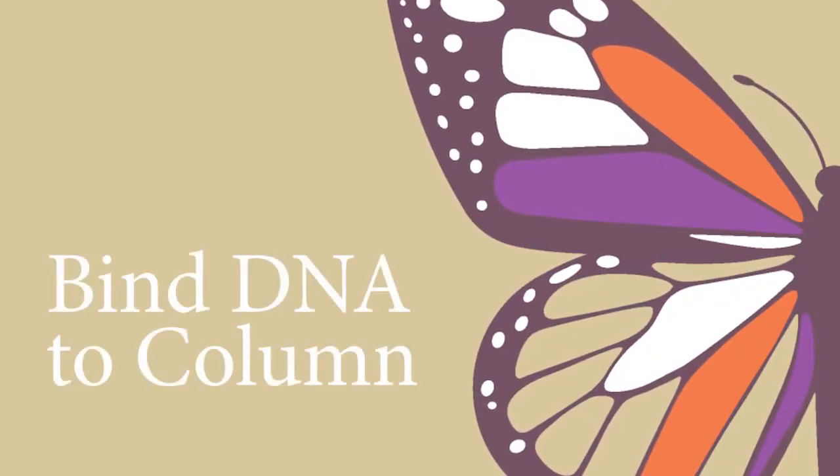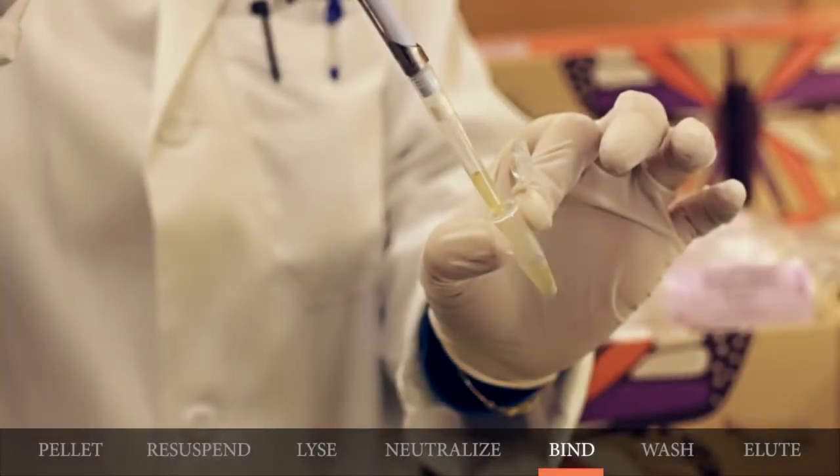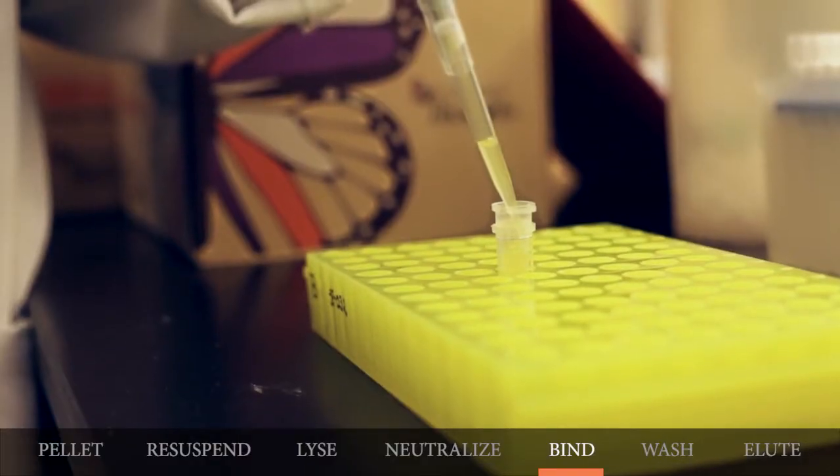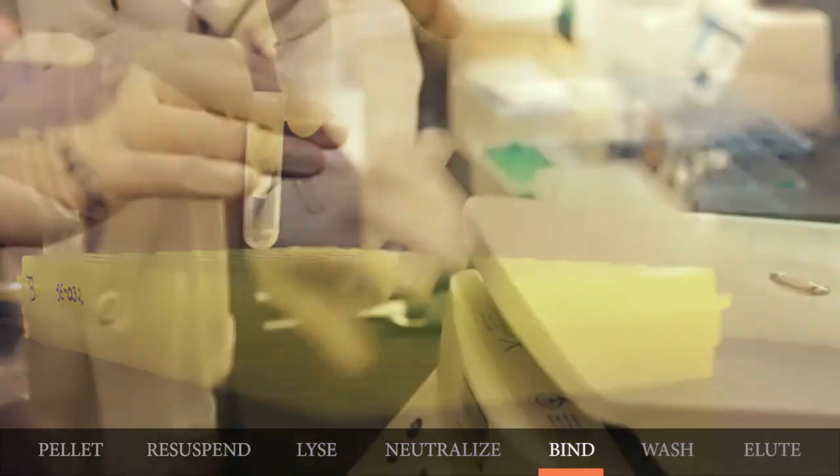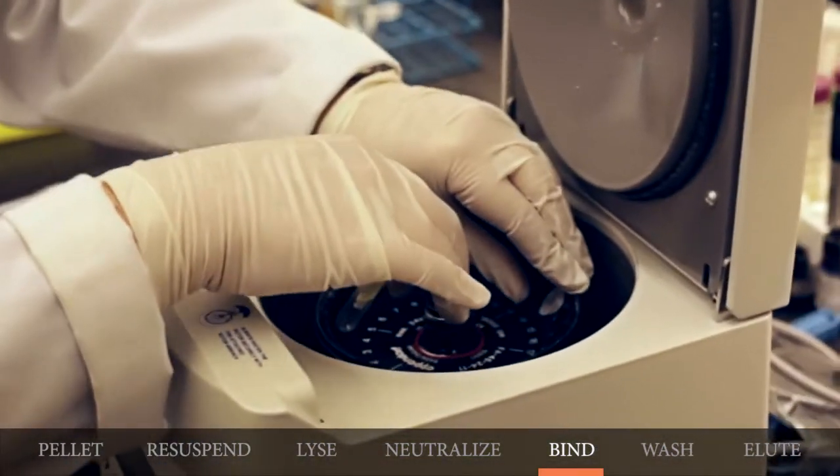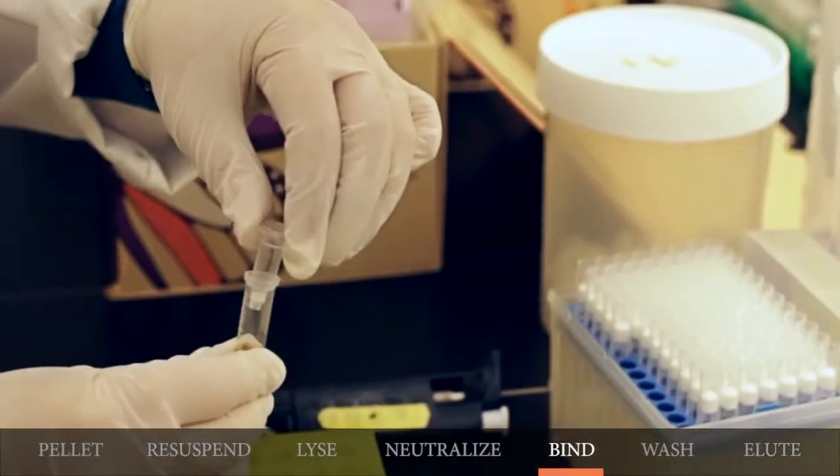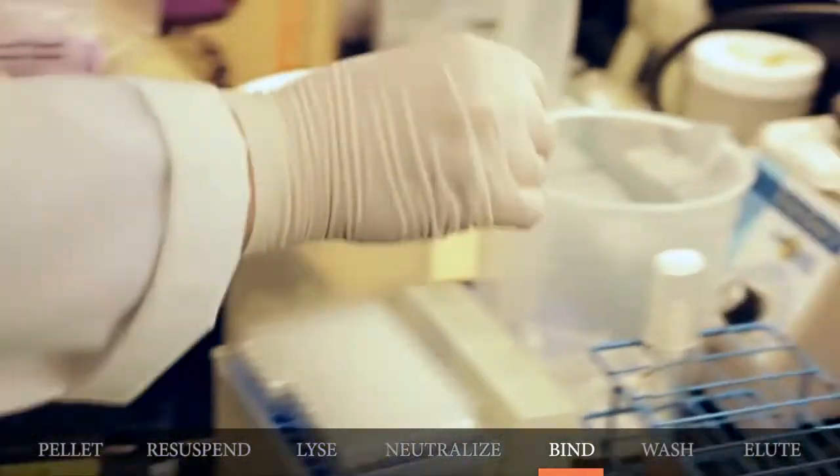Now to the binding step. You will carefully transfer the supernatant which contains the plasmid DNA to a spin column and you will centrifuge for one minute. The DNA is now bound to the column's matrix. You will remove the column and you will discard the flow-through.